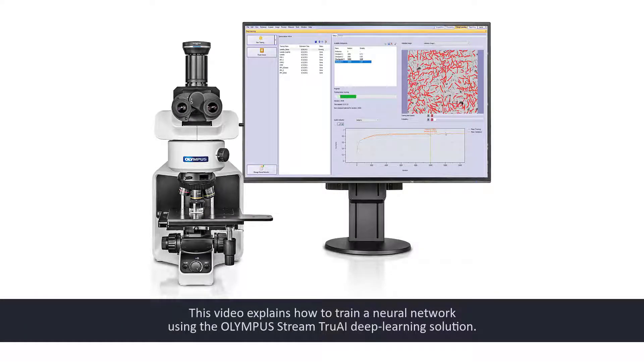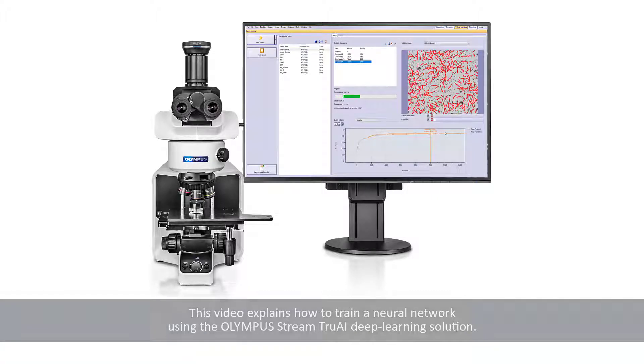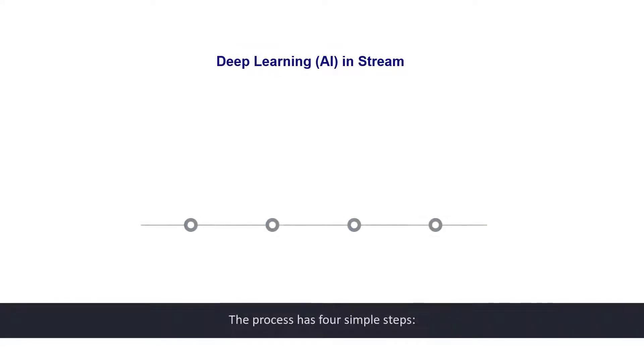This video explains how to train a neural network using the Olympus Stream TrueAI Deep Learning Solution. The process has four simple steps.